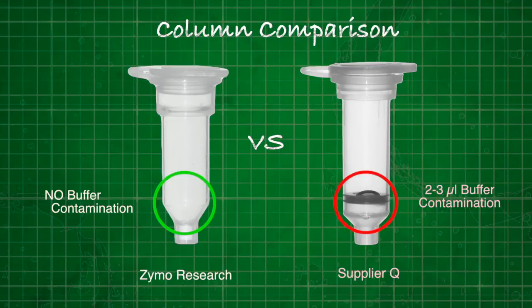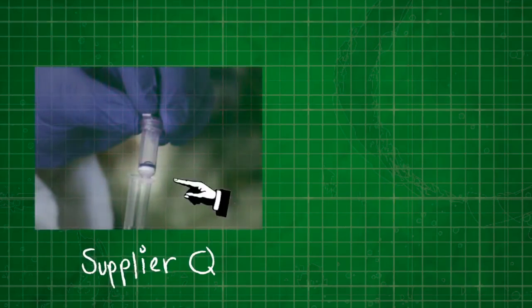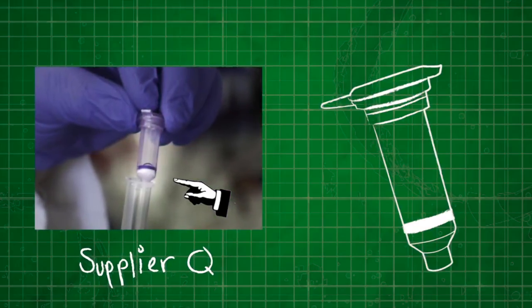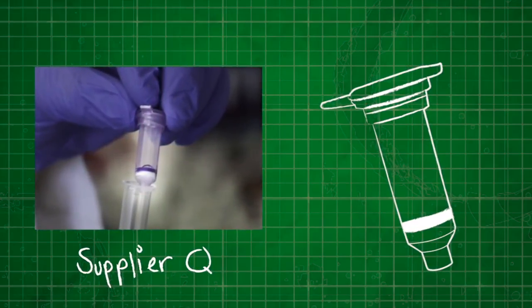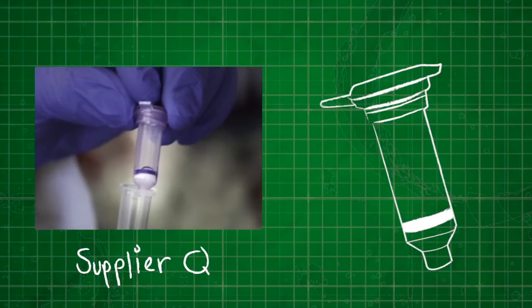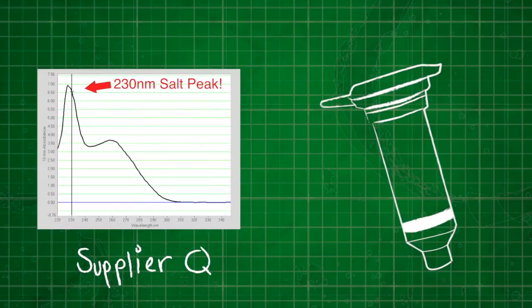Let's examine the column on the right from supplier Q. Do you see the two to three microliters of liquid left after spinning on top of the o-ring? That's two to three microliters of contamination that's going to be eluted out with your precious samples.